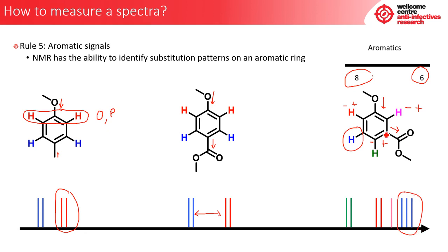Here we have which one comes first in the spectra. So we have the option here of the purple, pink, or the green. Which one is to come first? This site here, the green protons, are furthest away from the methoxy group, and therefore have the least influence compared to its ortho counterparts. In doing so, the green protons are the most affected by this electron withdrawing species, and therefore would appear higher up in the spectra, or more downfield.